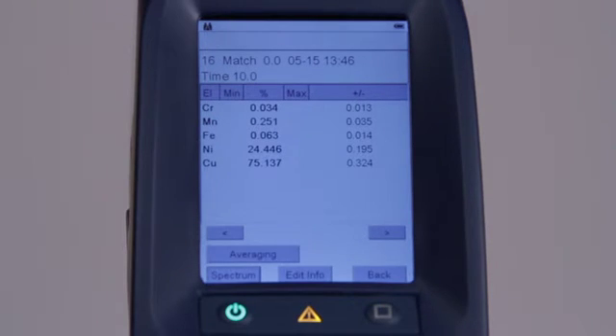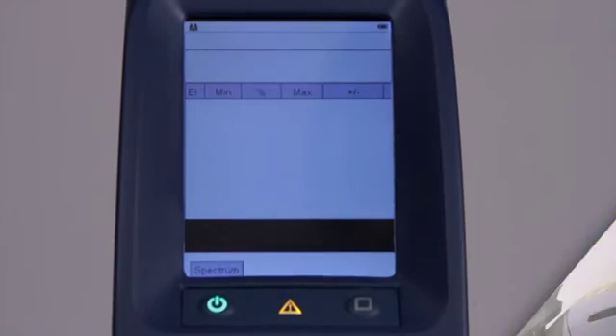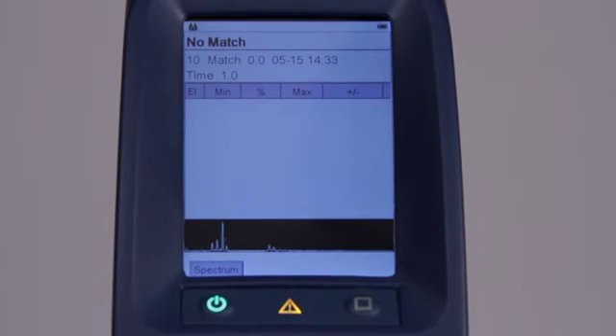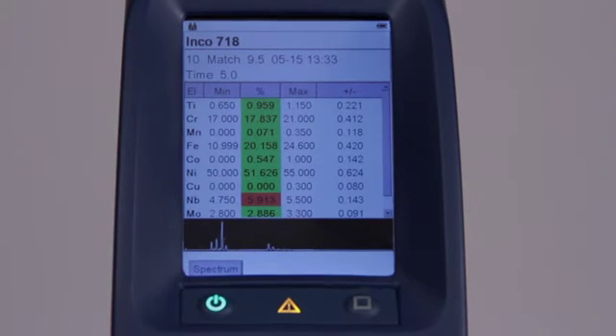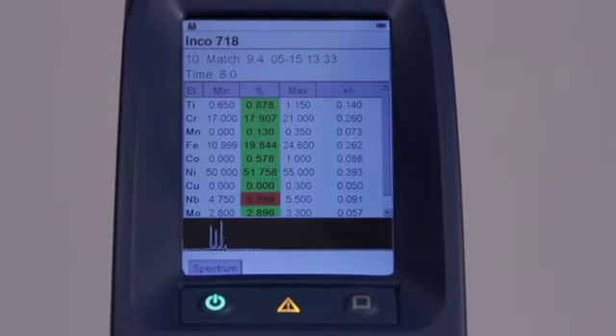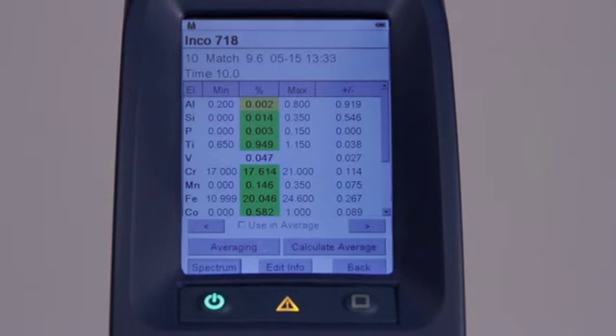For other display settings, see the user guide. At the end of each measurement there is a slight delay after releasing the instrument trigger and the end of the measurement. This allows the assay to be calculated and the measurement conditions to be reset for the beginning of the next measurement if necessary. It's essential to wait for the completion of the measurement before activating the trigger for the next measurement. When the small spectra at the bottom of the screen disappears, the analyzer is ready to perform the next assay.